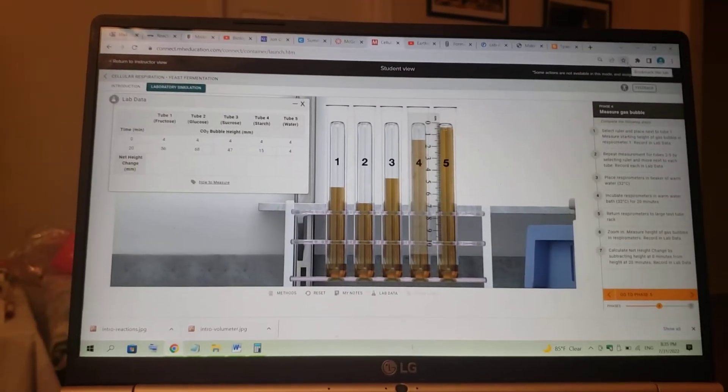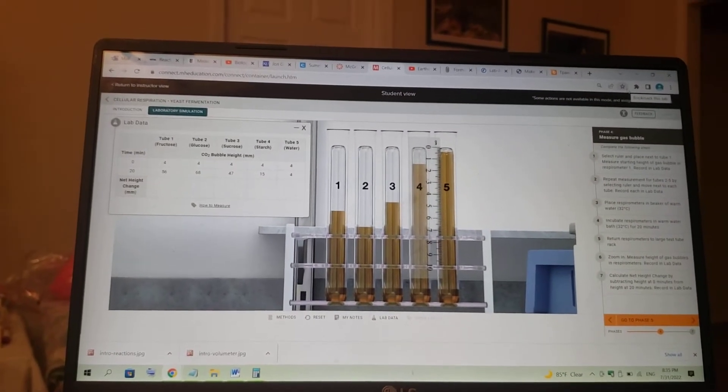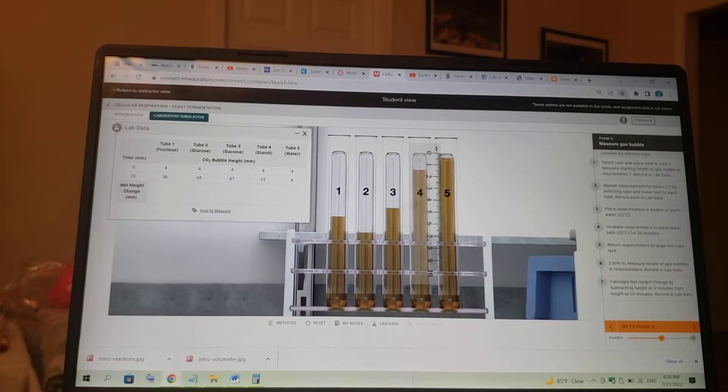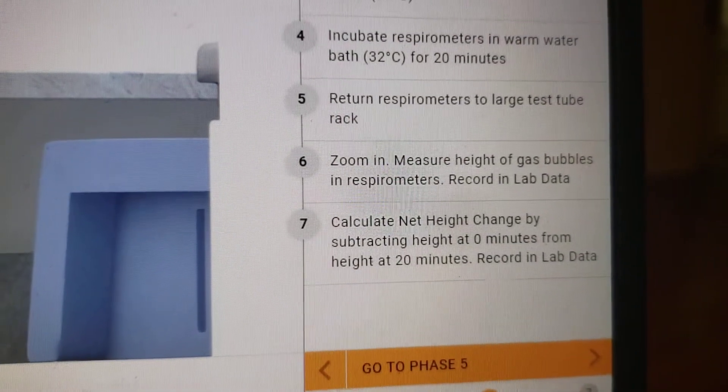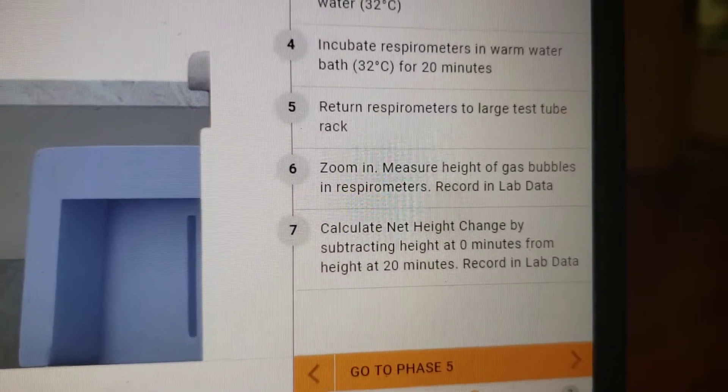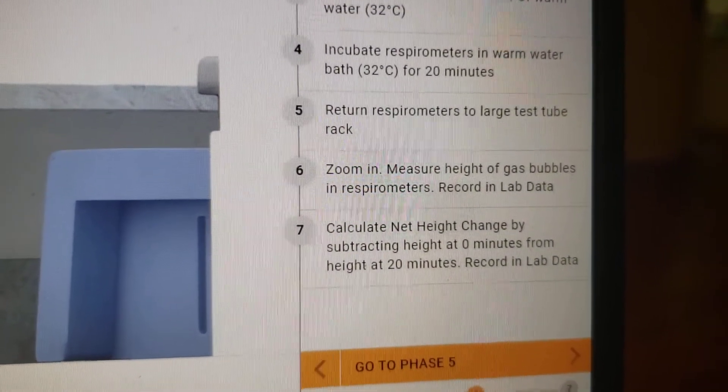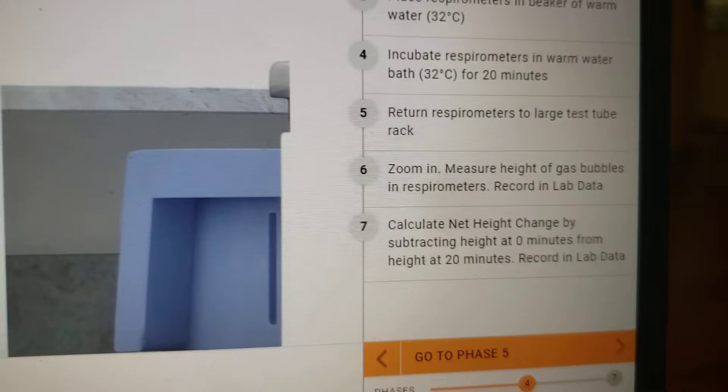Okay, yeast fermentation phase four, last step. Step seven, calculate net height change by subtracting height at zero minutes from height at 20 minutes, recording lab data.